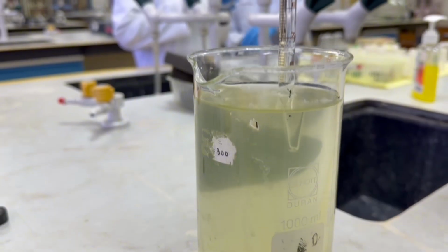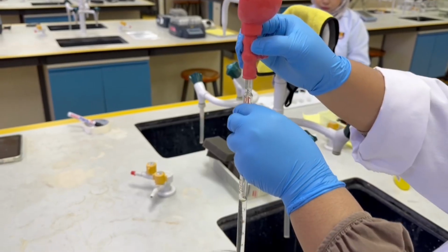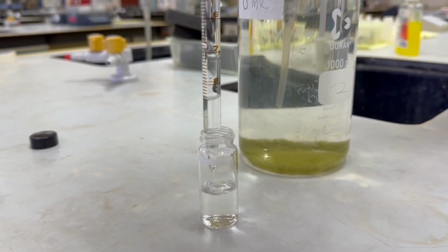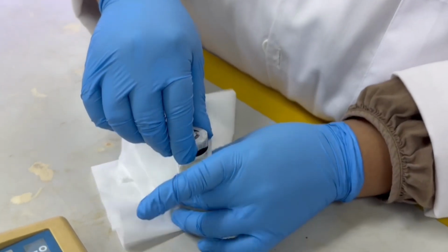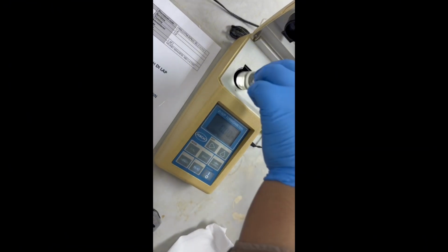For the procedure, measure 10 ml of water sample using a pipette. The water sample is poured into the sample cell carefully, making sure there are no air bubbles inside. Then, the sample cell was wiped using a clean cloth to remove any fingerprints. Next, switch on the turbidity meter, and the sample cell was placed into the turbidity meter once it is clean. Then, take the reading of the turbidity meter and repeat the same step for the rest of the sample cells.